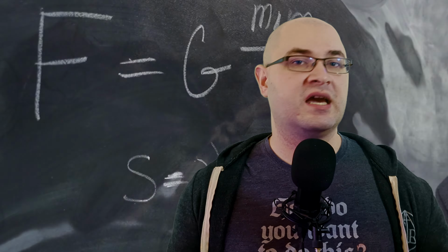The 1970s became the golden age for the technique, now formally known as X-ray absorption fine structure, or XAFS. At these new synchrotron facilities, like the Stanford Synchrotron Radiation Light Source, a team of researchers, Dale Sayers, Edward Stern, and Farrel Lytle, finally put the pieces together. They had the theory of where the wiggles came from, and the powerful synchrotron light needed to accurately measure them.